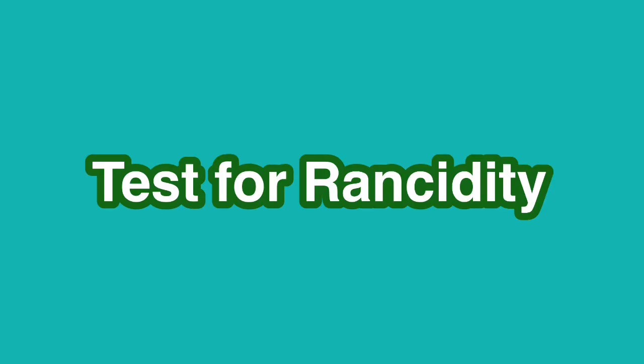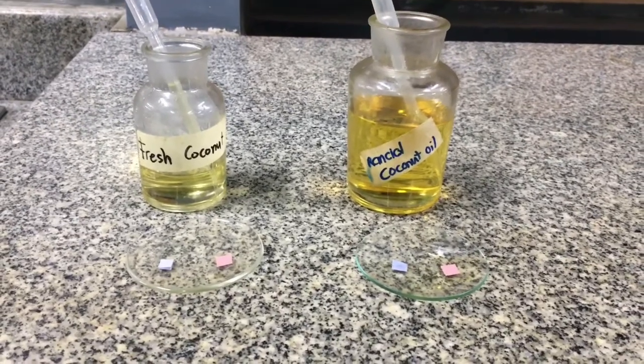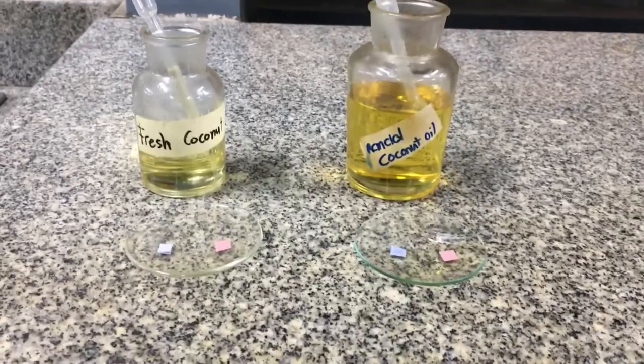The next test is to test whether an oil is rancid or not. Rancidity is the development of an unpleasant smell in fats and oils. When an oil becomes rancid, free fatty acids are liberated, making the oil acidic. The easiest way to test if an oil is rancid is to test its acidity through litmus paper.